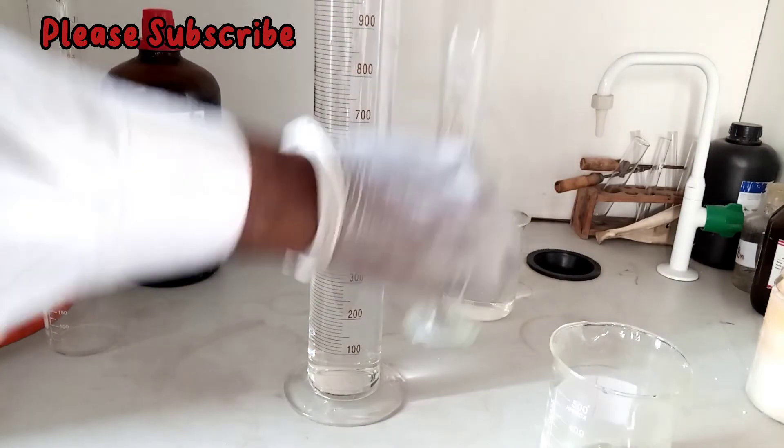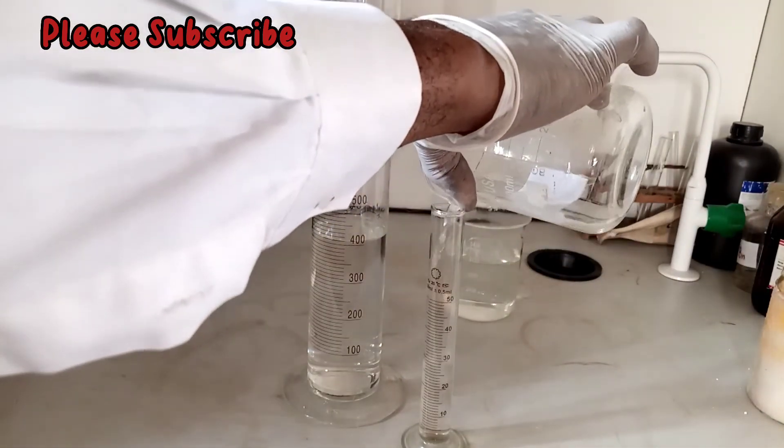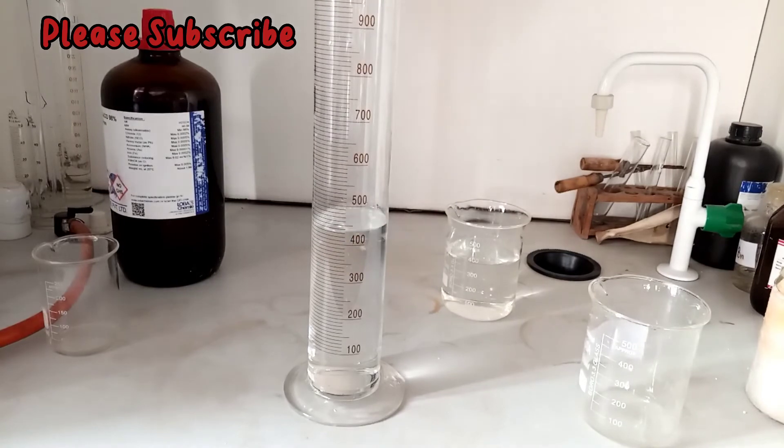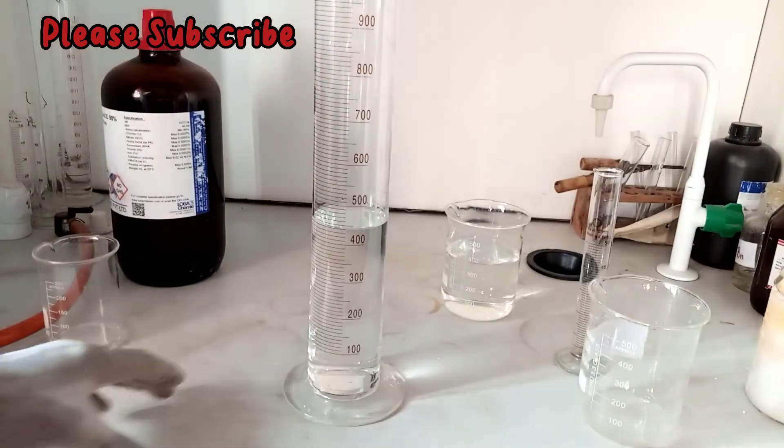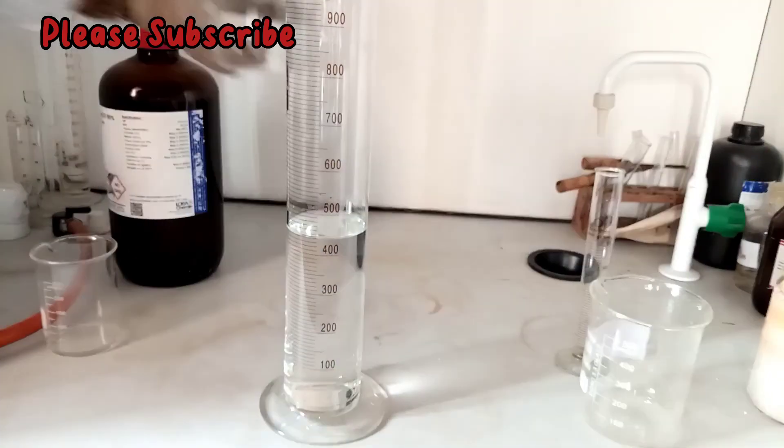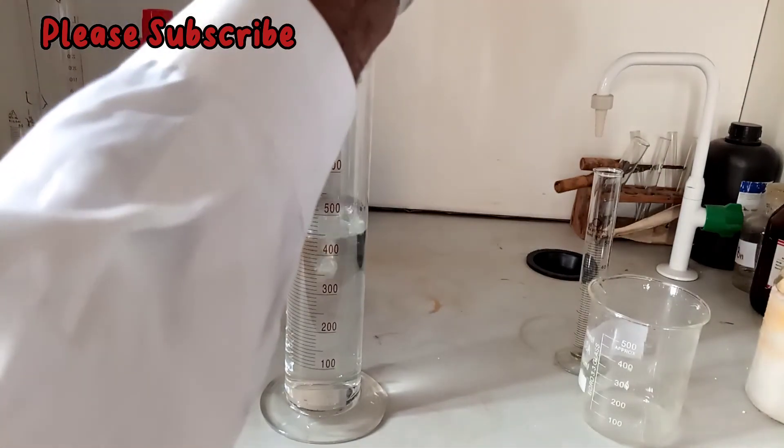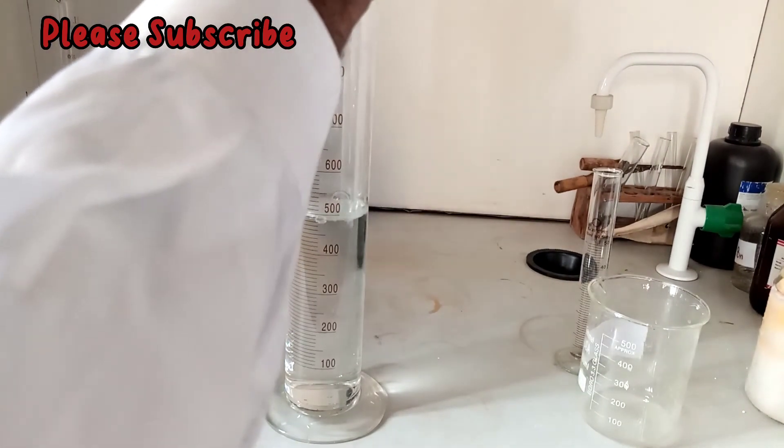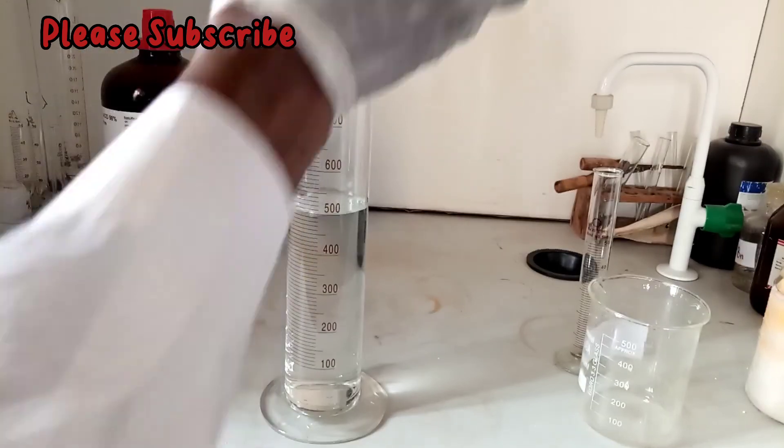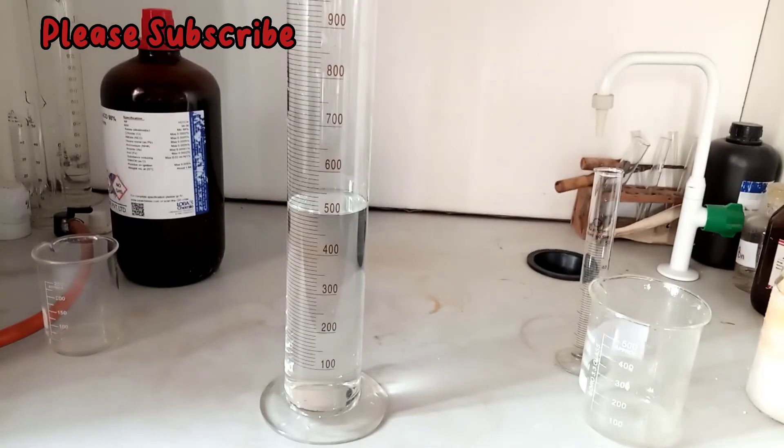You may also want to rinse out the little quantity of acid left in the measuring cylinder, the small measuring cylinder. And after that you dilute to the 500 cm³ with distilled water. Make sure you take readings at the meniscus.